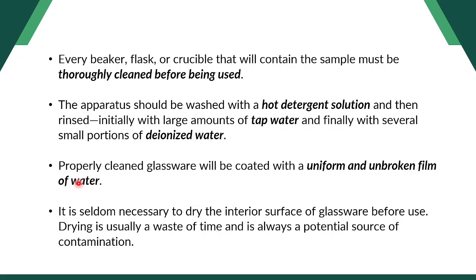Ang surface sa mga glasswares kay wala na mga residue sa detergent nga gigamit, wala na mga grease, mga oil, mga dust. So, inig hugas nimo, tapos paagasa na nimo ang deionized water, make sure lang nga inig balhin, like upwards, downward, ibali-balihon nimo ang glassware, ang whole part sa glassware, sulod, gawas, then make sure lang nga unbroken ang film sa water.